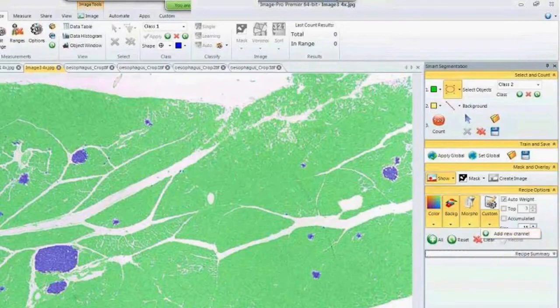Actually, on these images, you can see where you have the structure, and you want to measure, in this case, nuclei around those structures, measuring the epithelial nuclei. What we can do is set up an image pre-processing step that smart segmentation will take into account so we can find those particular areas. You'll see some more of this coming out when we release some newer apps in version 9 that are 9.1 compatible a little bit later on here.